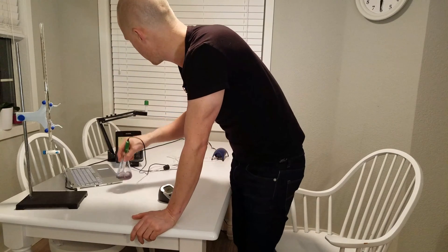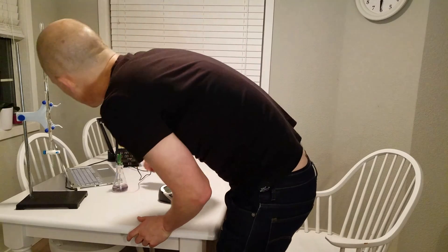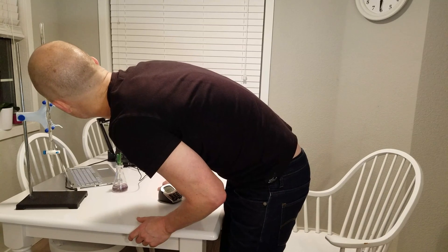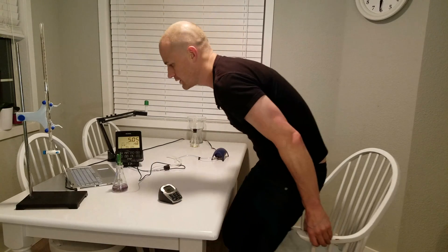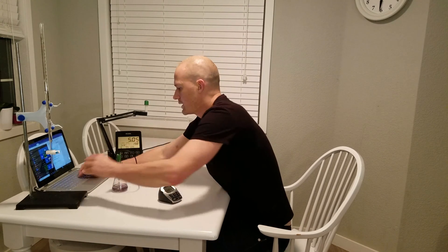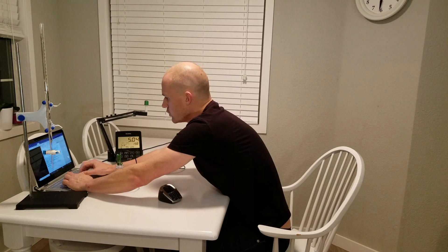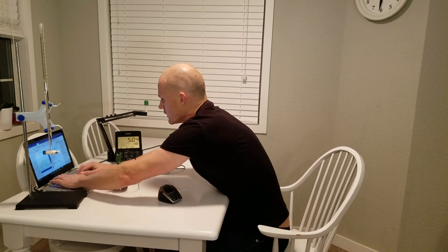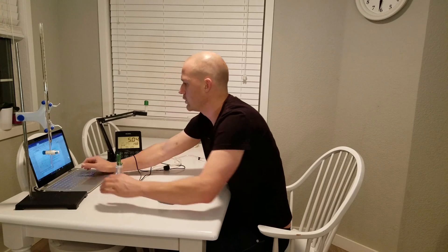Alright, that's a five right there. We went down from 13.1 — we used up a total of 0.6 mL. This Trader Joe's wine does not have a whole lot of SO2 in it, which is not very shocking. So 0.6 times 16 equals 9.6 — it only has 9.6 parts per million of free SO2. From there, you decide if you're going to add something to get more SO2 into it, and that's a different video. That's it for now — cheers!